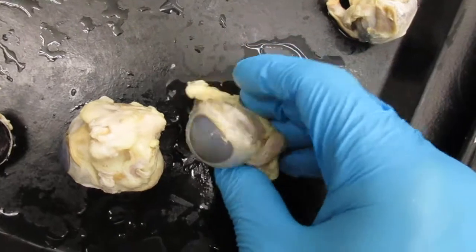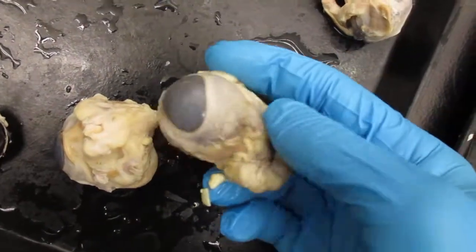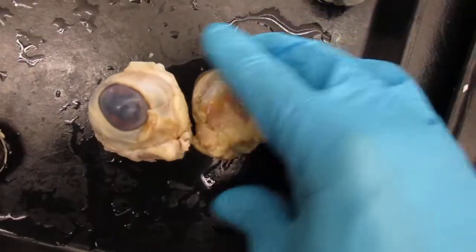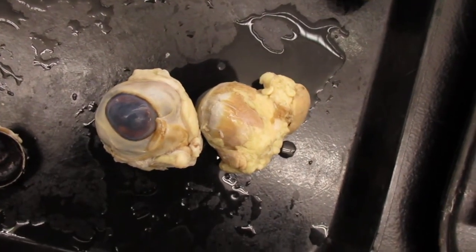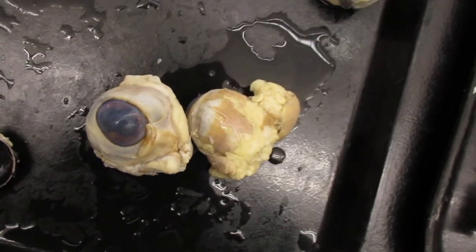Here's another one that hasn't been touched too much, hasn't been cut with a scalpel. So there's lots of fat mixed in with extrinsic eye muscles. So you can see that the sheep eye is going to contain lots of fat, just like the human eye.